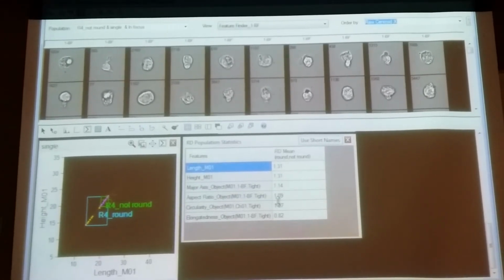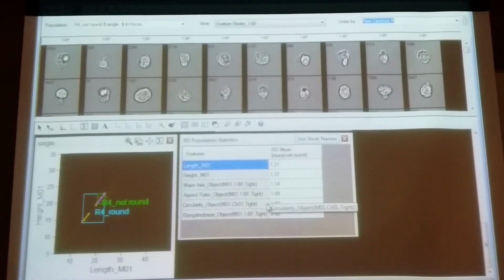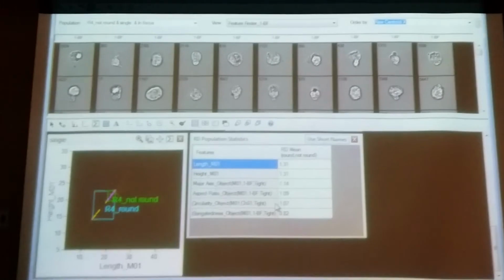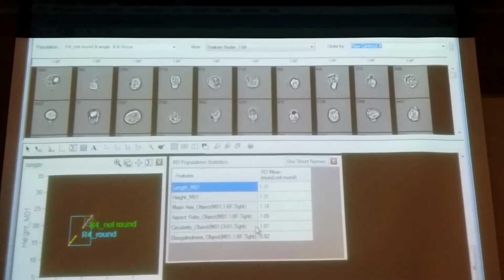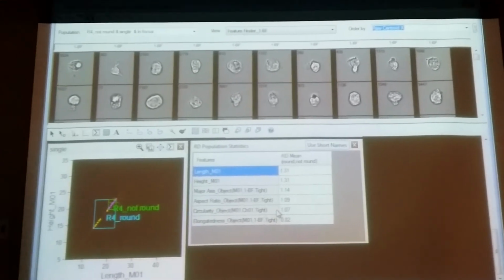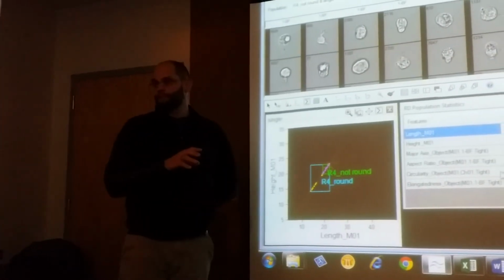Aspect ratio is one that we already used, as well as circularity. That's the one that the cell. But this is all based on my truth set. Sometimes what will happen is I'll tag them all, and I'll get the separation, and I'll find out that it didn't quite separate it the way that it is, and I'll realize that my tagged population, I was biased in it. Like I didn't actually represent the populations that I wanted to represent.